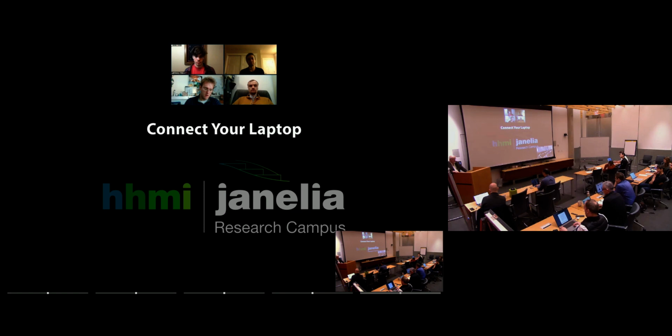And with our open hardware, we're particularly keen on small companies selling instrumentation using Micro-Manager as the software and selling the hardware plugins for the open frame, which I can show you on my computer if you want to come and see me. And basically, there are companies that would only do that if they could use their own software with plugins to protect it. And so we spoke to a company last month, and they said, we tried to work with Micro-Manager, but we're too worried that people could steal our software.